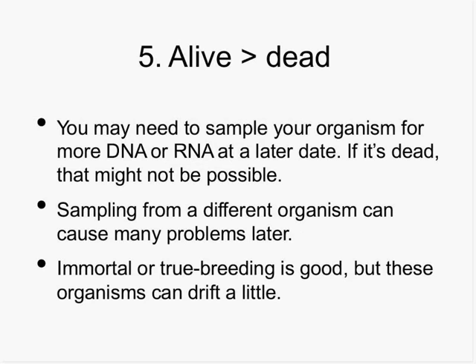Alive is better than dead in pretty much everything, but you may need to sample your organism later on. You might want to go back and say, I need more DNA, or I need more RNA because now that I did my RNA-seq, I realize it's messed up, or I did a normalized one and now I need a quantitative one, or vice versa. Well, if it's dead, it's going to be hard to do. And if you sample from a different organism that might be related, it could cause you problems in the assembly or analysis later on. So it's nice if you can get a big giant organism that's still alive and you can go back to it later on.